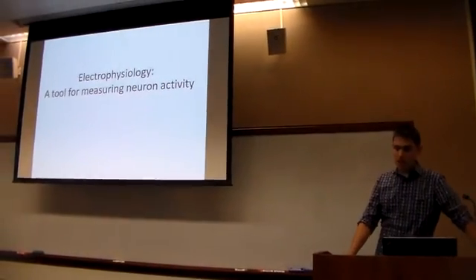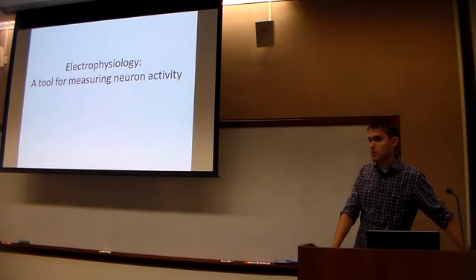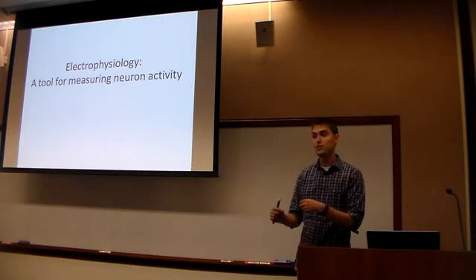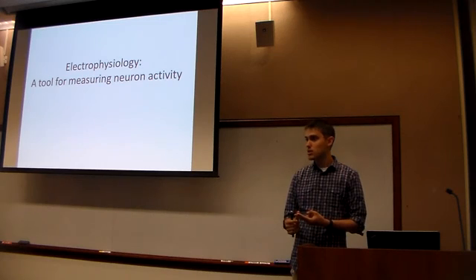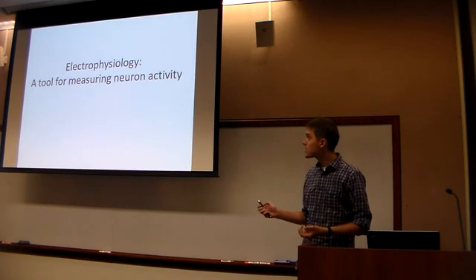touch in the past. And today, I'm going to be talking a little bit more about the tools we use to study these. So when we took you guys into the lab, we showed you some of the big microscopes and rigs that we have for measuring the electrical activity of cells. This is a way of studying our touch and heat sensitive neurons, and it's also a way of studying the molecules that are involved in heat and touch. And so right now I'm going to talk a little bit about the science of how this works.